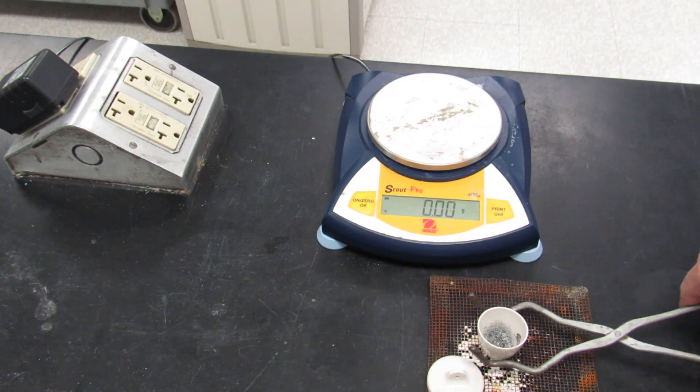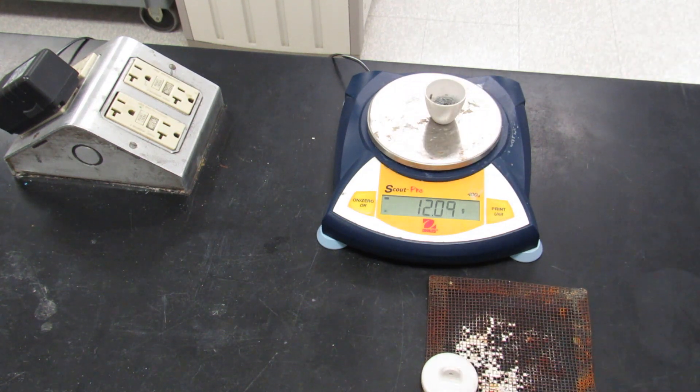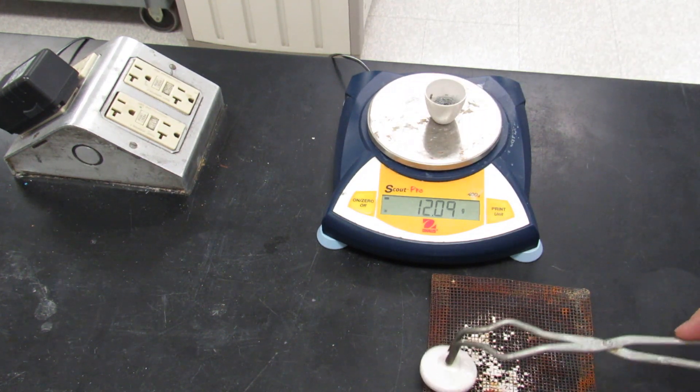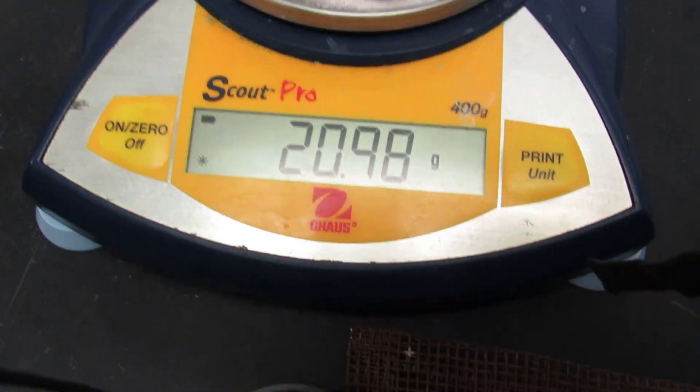Then when you're done, go ahead and mass the crucible and cover. Let's see if it changed that much. Crucible cover and now the cleaner oxide. The mass this time is 20.98. It really didn't change much at all.